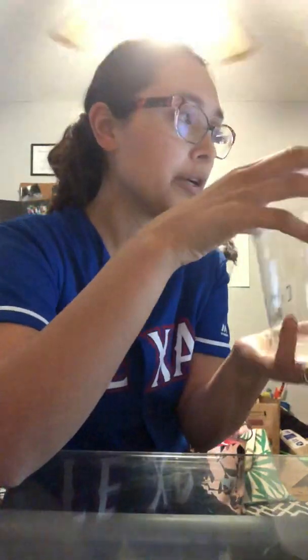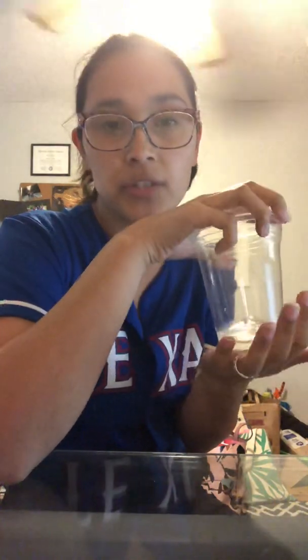Everything looks yellow in this light right here, but it is clear. Okay, so what I would put for water, that second column: it's really cold actually. A temperature decrease, crystals dissolved, no color change.